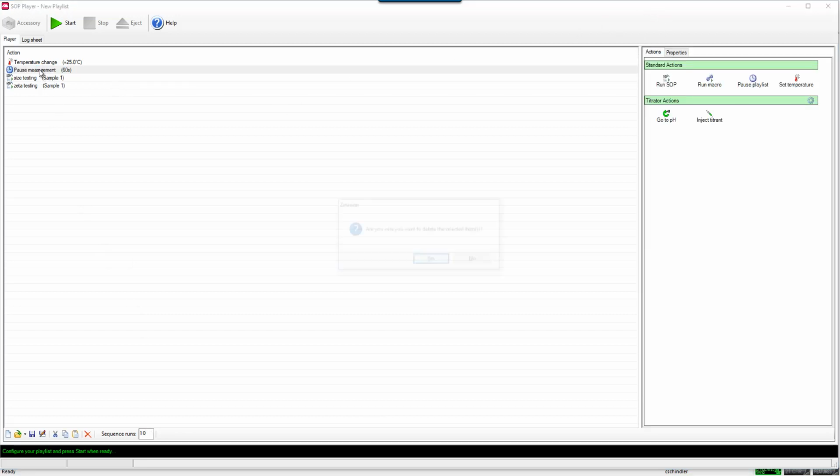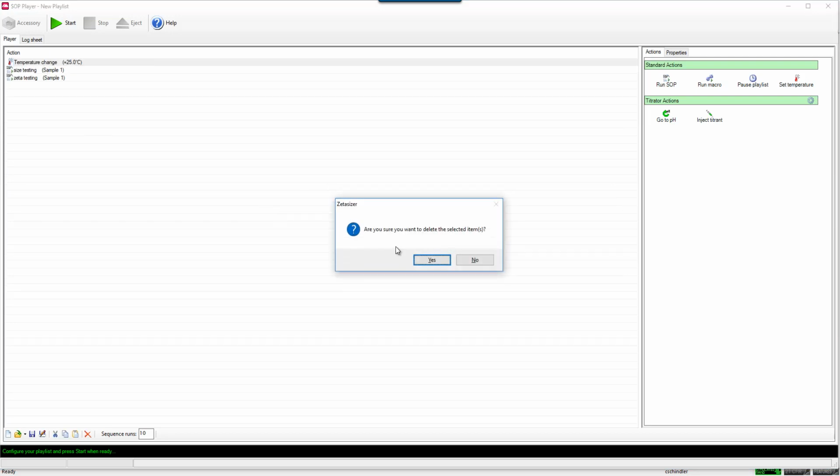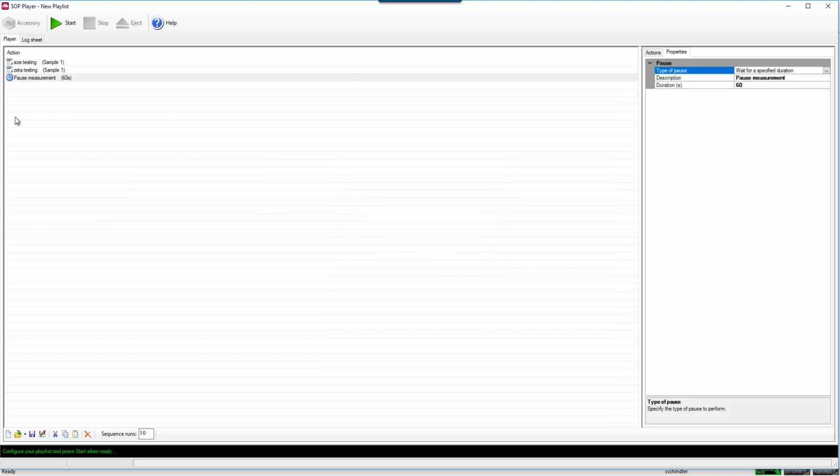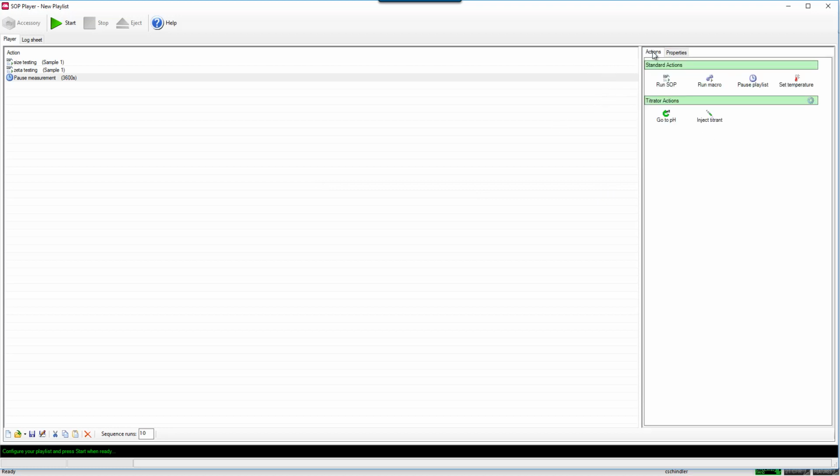Another thing you could do is, okay, maybe I want to do a time study. So maybe I want to do size, zeta potential, and then I want to pause my playlist for a significant amount of time. And this is in seconds. Pause, wait, and then go back and do another sizing and zeta potential measurement and continue on. And then you could loop that multiple times as well.